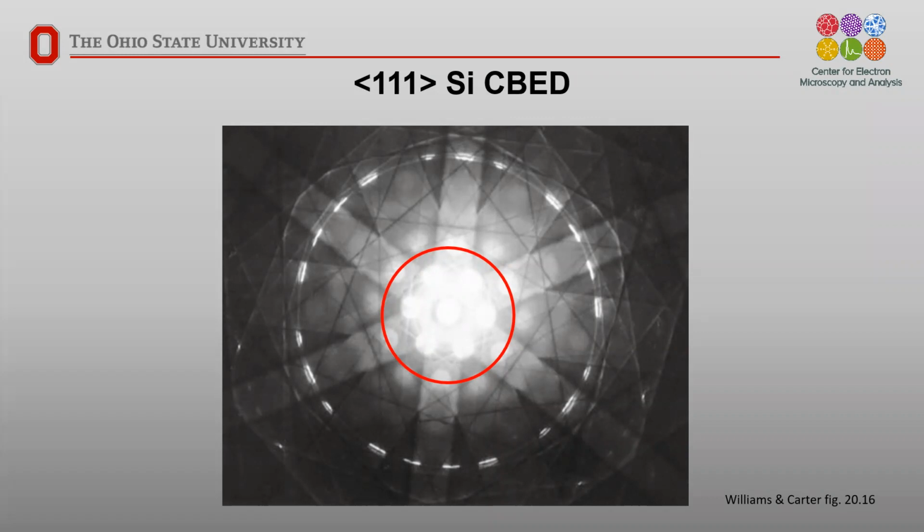But now, if it's hexagonal, we should be able to rotate the pattern by 60 degrees, and it should match up as well. And if you look at it here in this outer ring, you've got two small arcs. If I rotate it 60 degrees from 2 o'clock up to about 12 o'clock, you see that at 12 o'clock, there's only a single line in that ring. So the hexagonal rotational symmetry doesn't exist. You don't have a six-fold rotational symmetry.